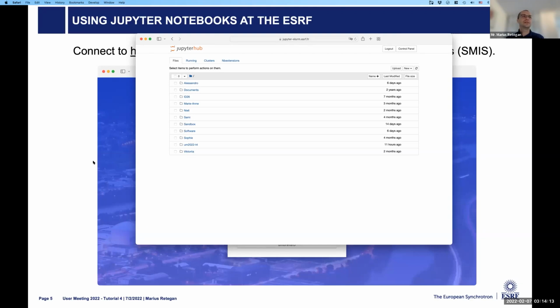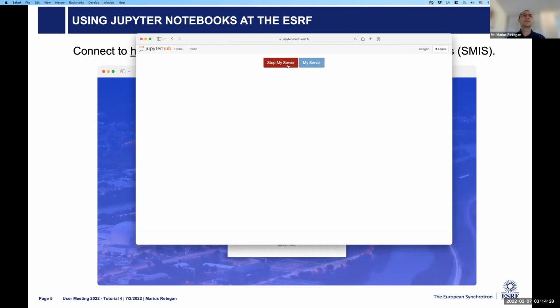Sorry, it doesn't show what you show. It says unknown status. Okay, so I'll stop my server. Let me redo this again. Start my server.